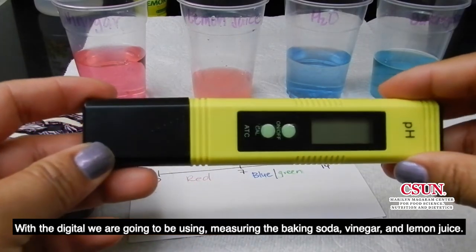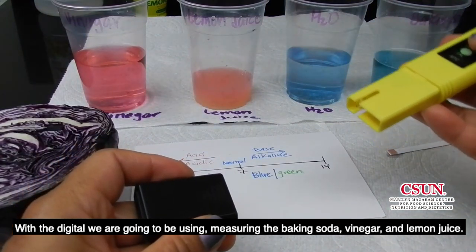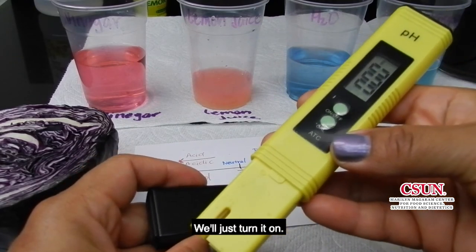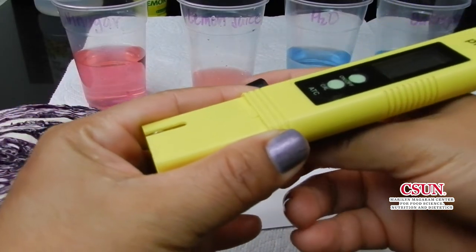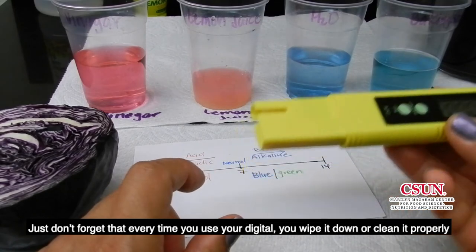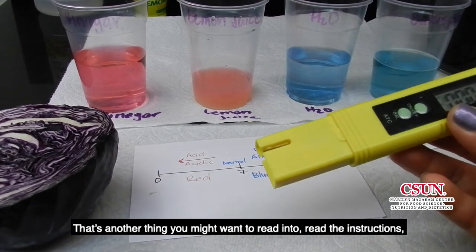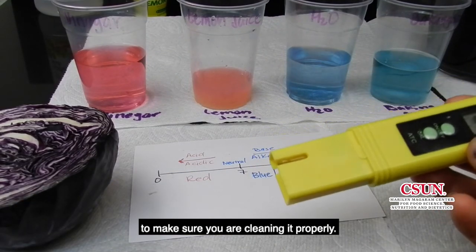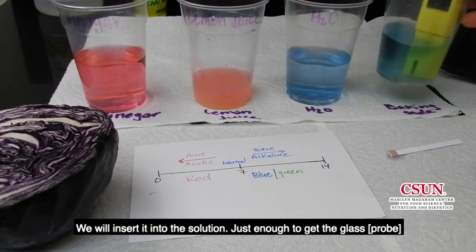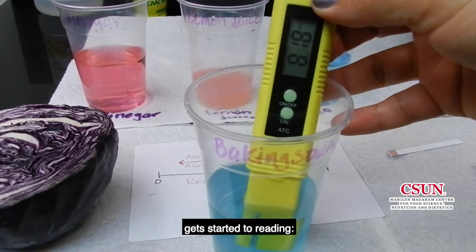With the digital, we're going to be measuring the baking soda, vinegar, and lemon juice. We'll just turn it on. Just don't forget, every time you use your digital, you wipe it down or clean it properly. That's another thing you might want to read the instructions for to make sure you are cleaning it properly. We will insert it into the solution just enough to get a reading.